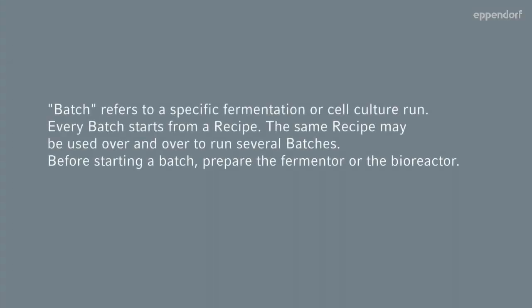Batch refers to a specific fermentation or cell culture run. Every batch starts from a recipe. The same recipe may be used over and over to run several batches. Before starting a batch, prepare the fermenter or the bioreactor.